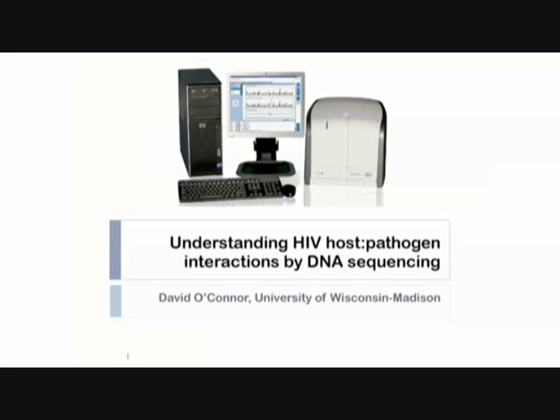So what I'm going to talk to you about today is studying HIV through next generation or second generation DNA sequencing. For some of you who may have come to this class in the past, this is a topic that is near and dear to my heart and one that I've been talking about for the last several years.